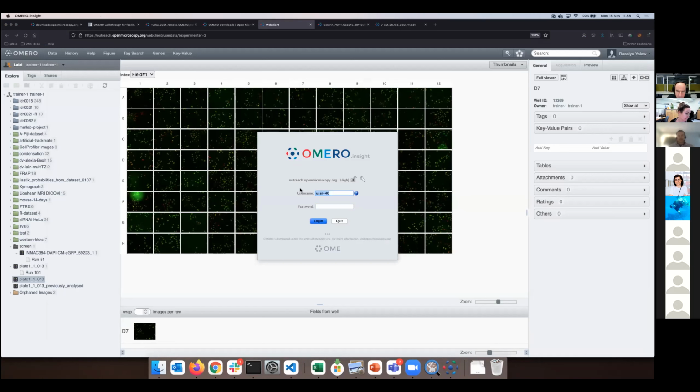Let me just quickly show you the workings of doing something on behalf of somebody else. Importantly, realize that a user can be a member of many groups, as many as there are groups in Omero. So multiple might be the group membership of that user. So you can have a club card to any door, which is nonsensical in a way, because that would be a little bit too haphazard, but it is possible.